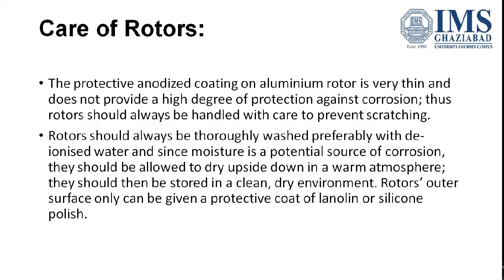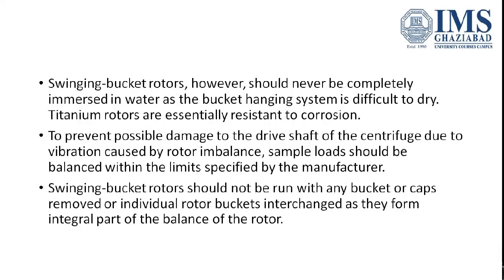Now another problem can be high temperature, there can be a rise in temperature. So avoid this. Appropriate breaks should be given to the rotor while you are continuously doing your centrifugation. So in case of swinging bucket rotor, you should never completely immerse it in water as the bucket hanging system is difficult to dry, and titanium rotors are essentially resistant to corrosion.